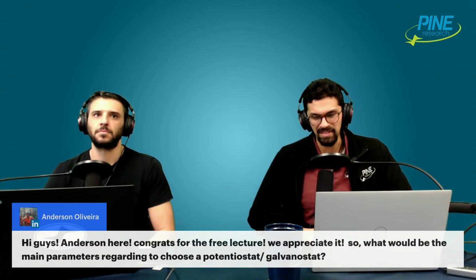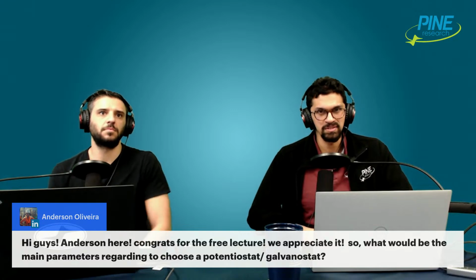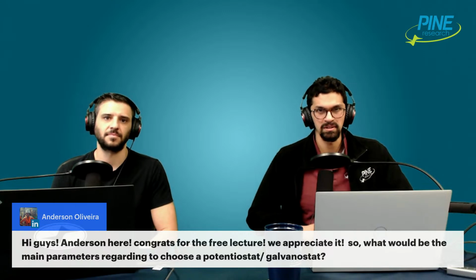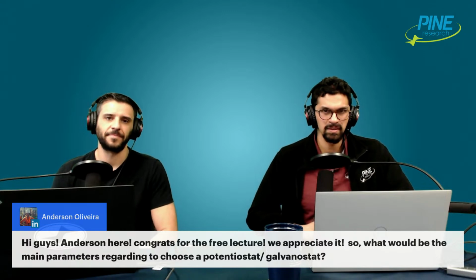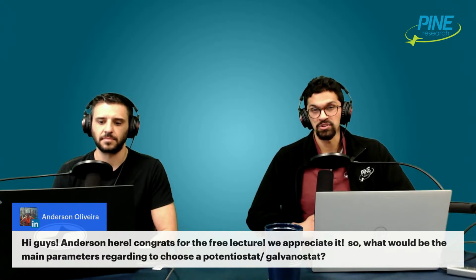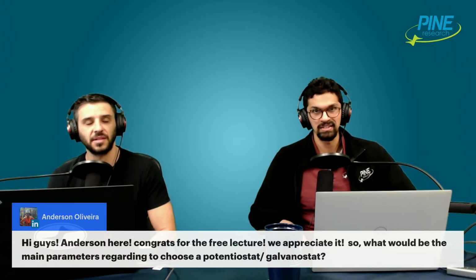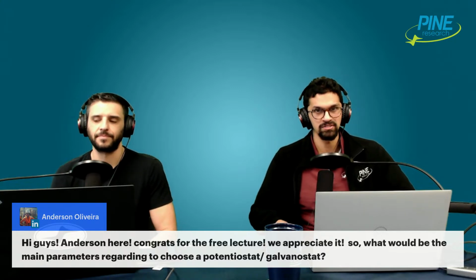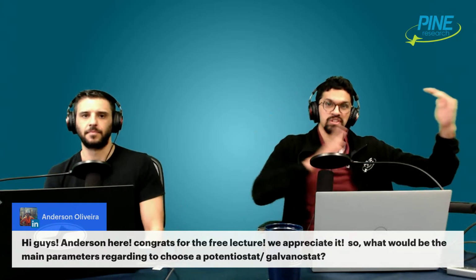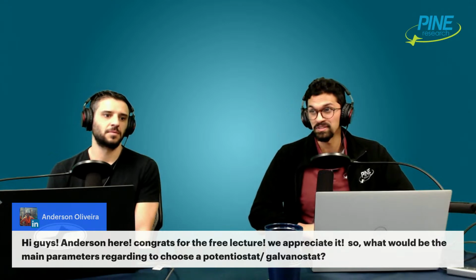And really, it depends on the experiment. Sometimes people are doing crazy wild sequences of experiments with weird time resolution. And if you're doing very low current experiments, you need a current range. We're talking about the high end current range, but some people are doing nano and picoamp resolution stuff, and so that's the other extreme, so to say. So it depends, but those are all the main parameters.